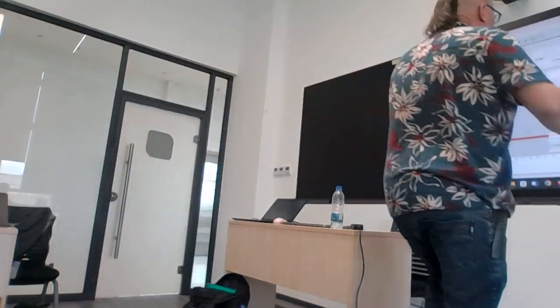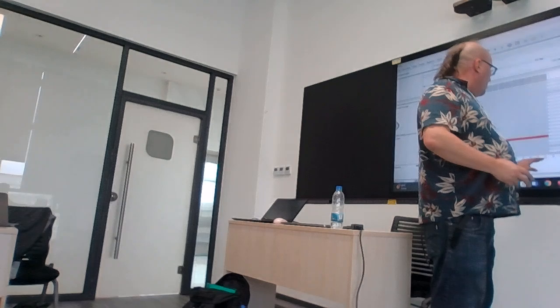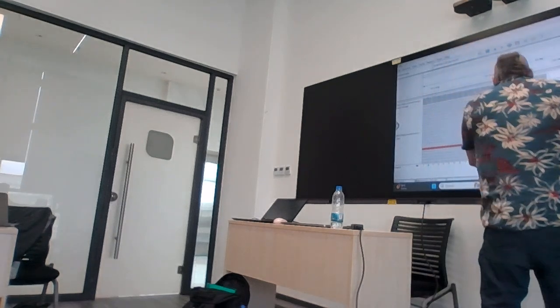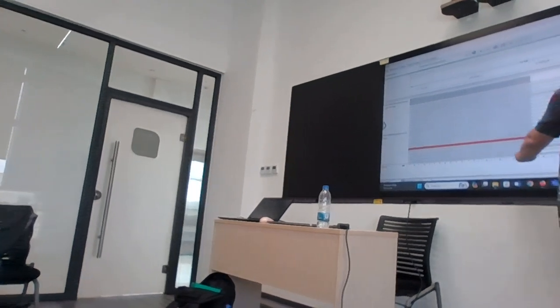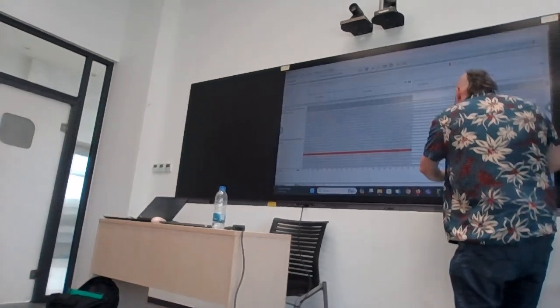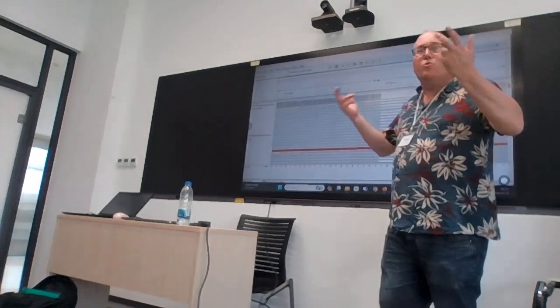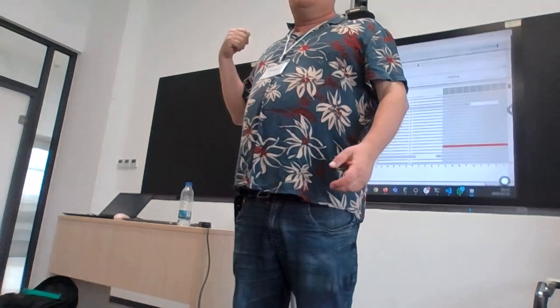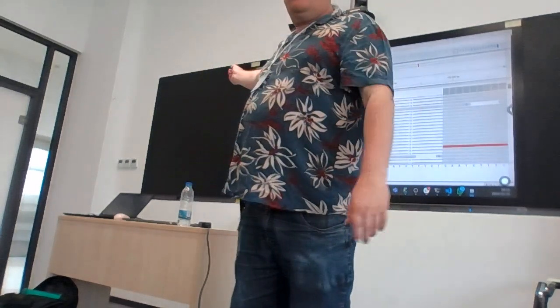that means that 10 disappears. If the codons are here, CGG, CAA, codon 1, codon 2, codon 3, codon 4, and then half of a codon is missing, or two-thirds. I'm surprised by this. This is a frame shift mutation, but there's strong evidence that it's real.